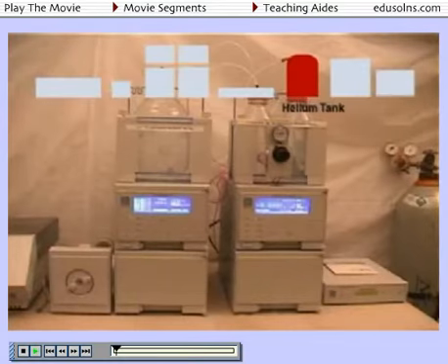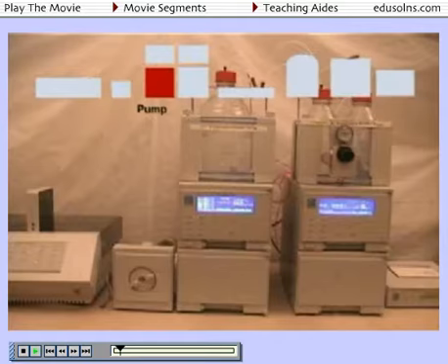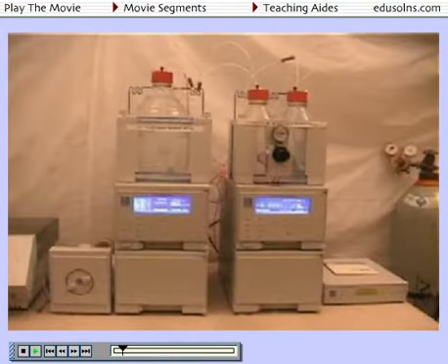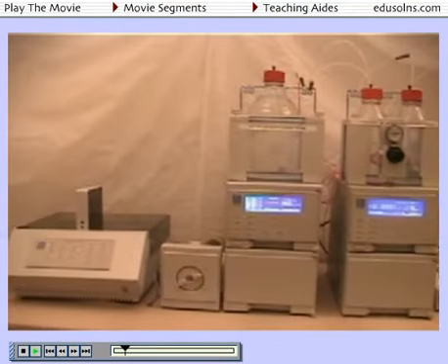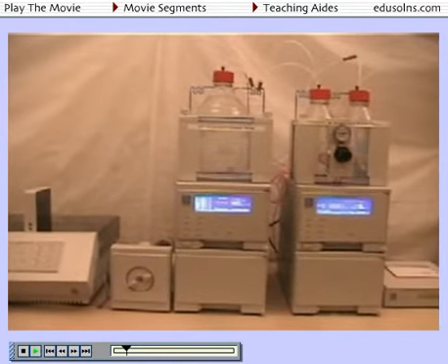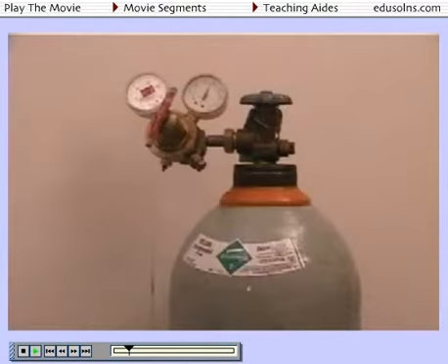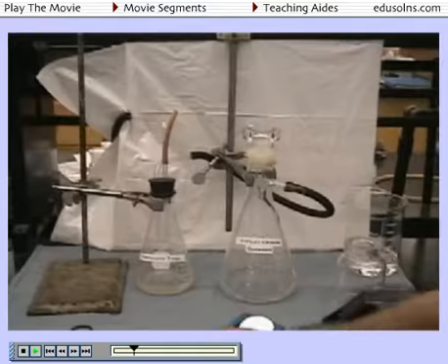A basic HPLC system consists of a pressurized gas cylinder, mobile phase reservoirs, an autosampler, sample injection system, high-pressure pumping system, guard column, analytical column, detector, and data processing station. Selection of the mobile phases varies depending on the application, but once the proper gradient has been selected, they are all handled as follows. We will start with a degassed solvent that serves as the mobile phase. Solvents can be degassed by vacuum filtration or by purging with helium gas.